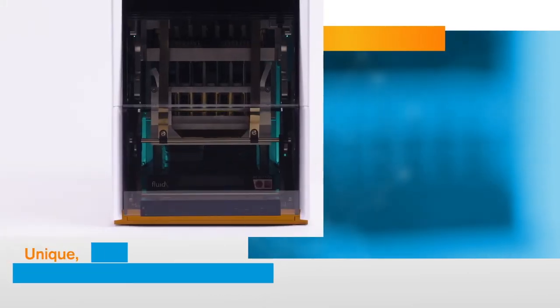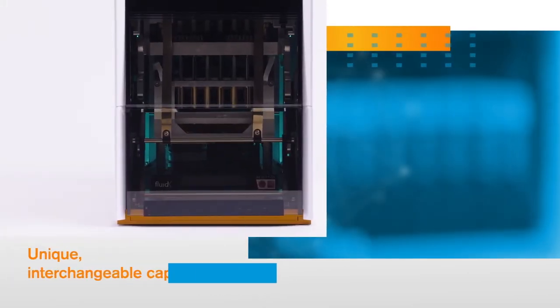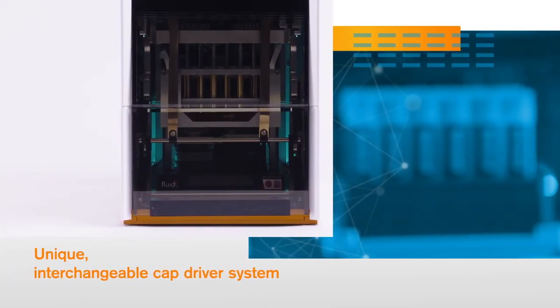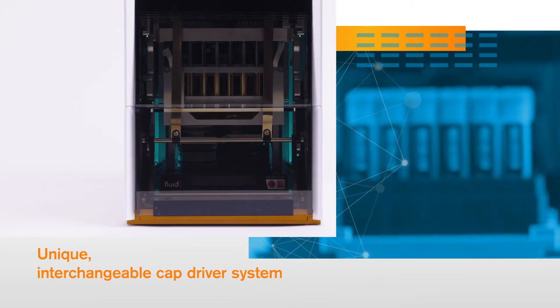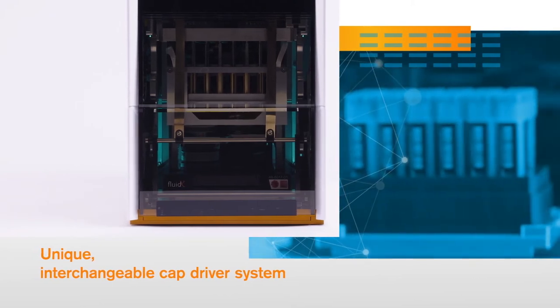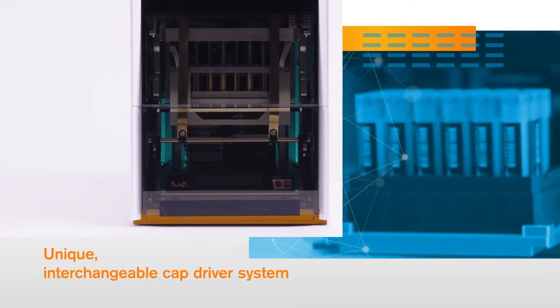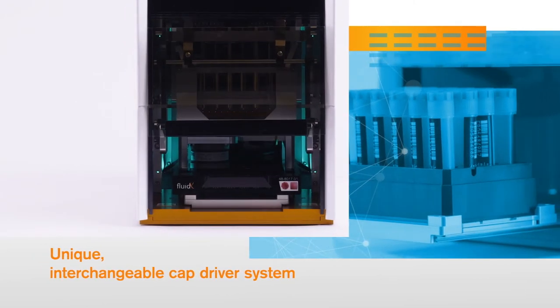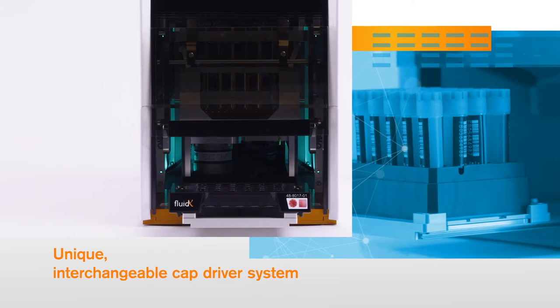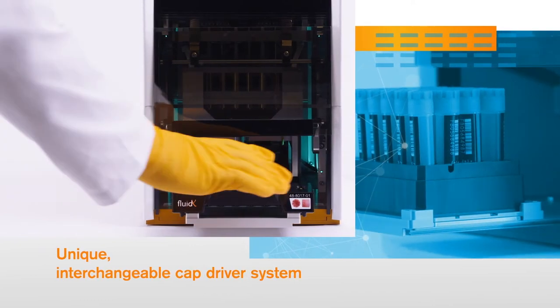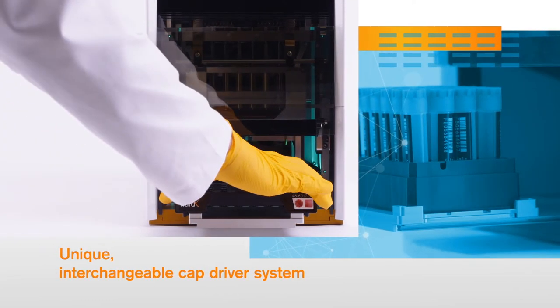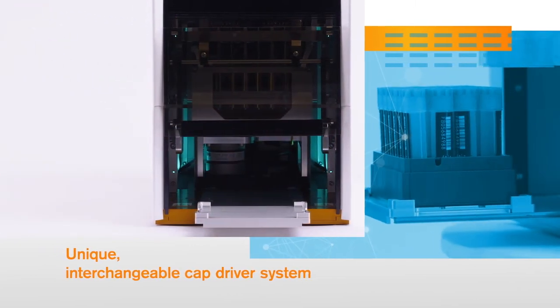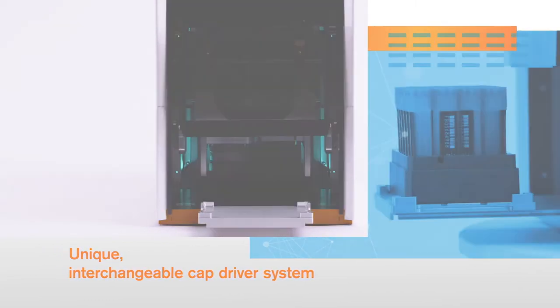This flexibility comes from its unique, interchangeable cap driver system. With the right cartridge in place, the Intelli XCAP24 can accommodate any automation-friendly Fluidex sample tube, plus a wide variety of tubes on the market in a 24-format SBS rack.